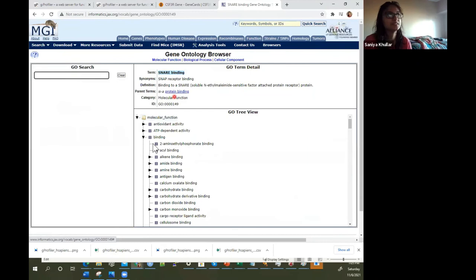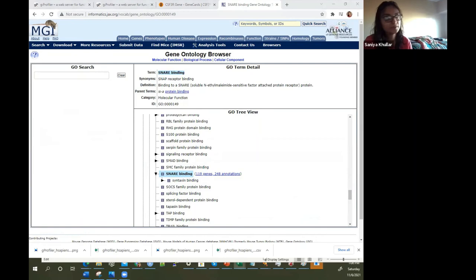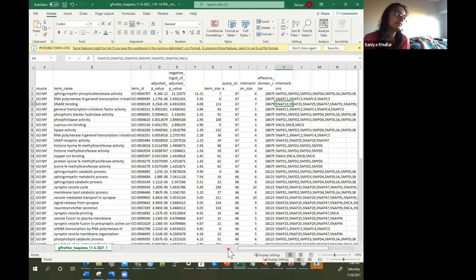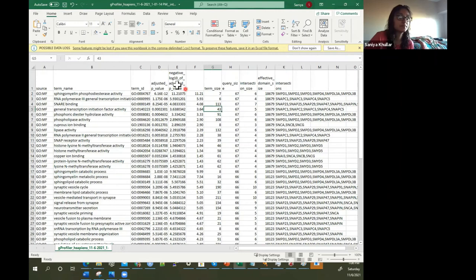For the human genome, which is what we were doing, it's about 113 genes and there were seven overlaps from our original list. That's how they're calculating and doing the annotations. The term size corresponds to the number of genes in that annotation set, and then we have the intersection size — how many from our input list overlapped.